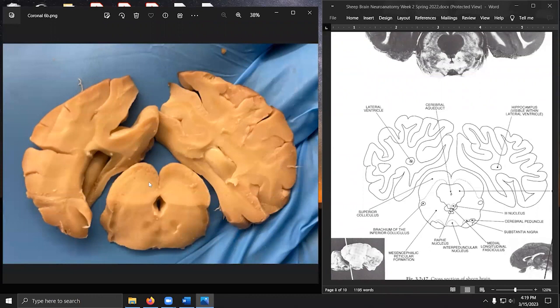This one, we have some features that are more pronounced, some features that are less pronounced. We can see that the cerebral cortex hemispheres, we're now looking at the back of the cerebral hemispheres, and they are basically separating off the brainstem as they are in the picture here. So they are not held on by anything once we section the brain this way. You'll also notice there's this sort of bulge here. That's the last piece of the hippocampus. We kind of see the cavity in which the lateral ventricle exists and back piece of the hippocampus. This one's flipped upside down, if people are wondering.